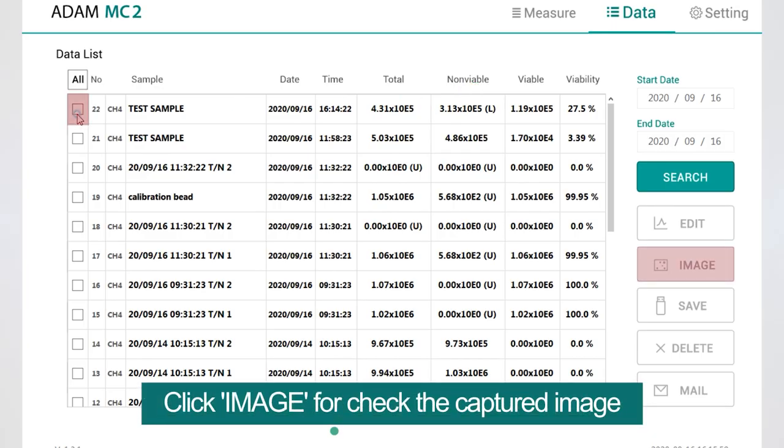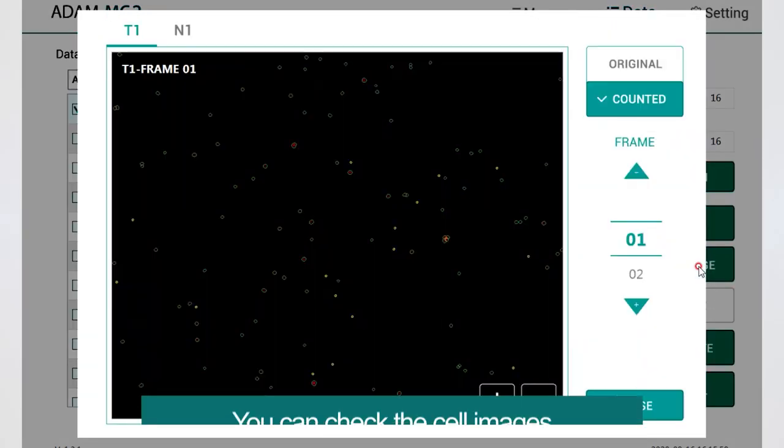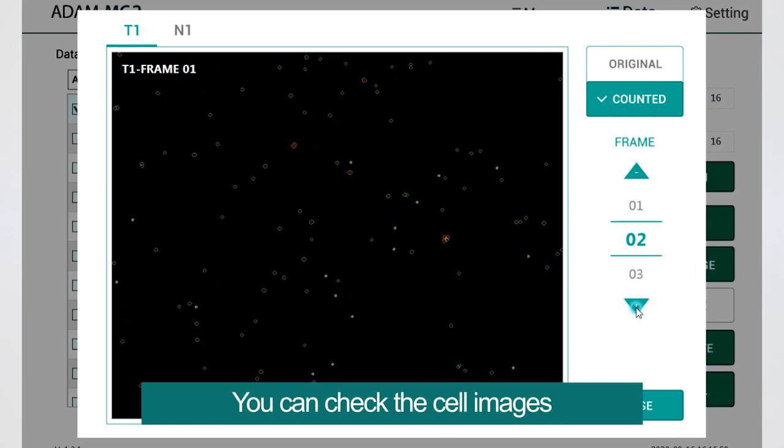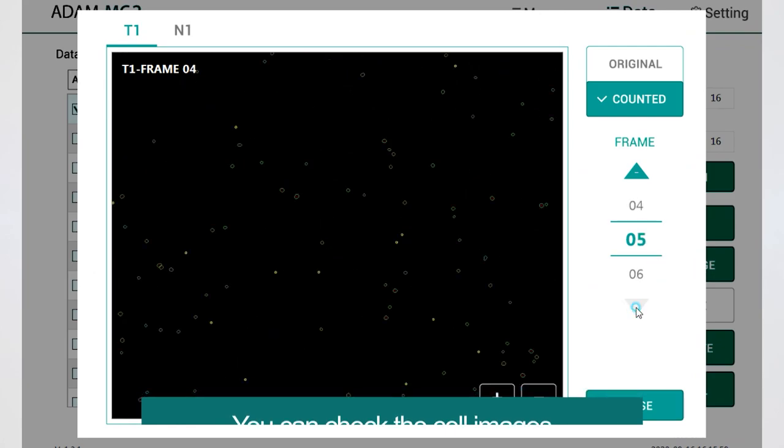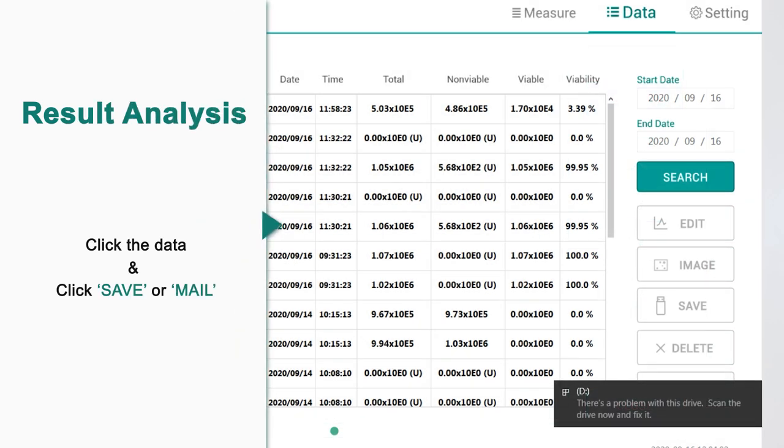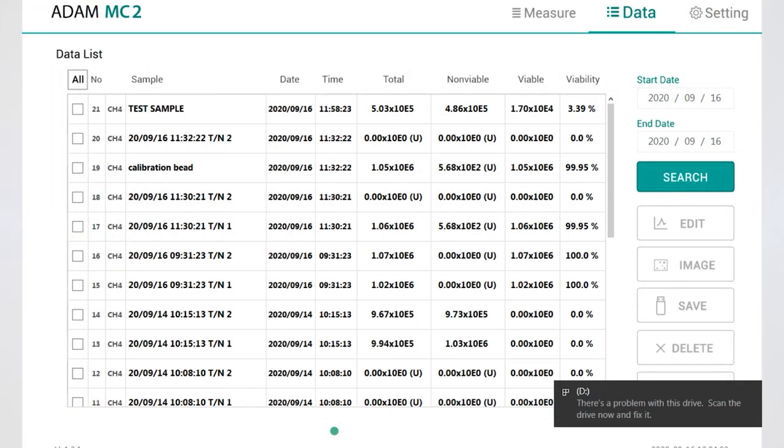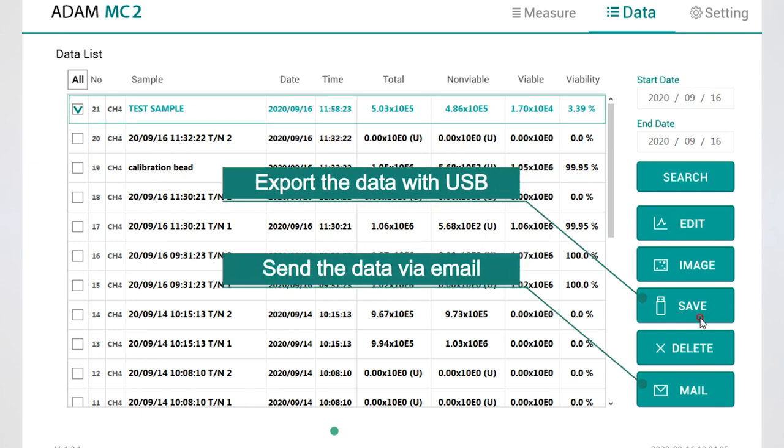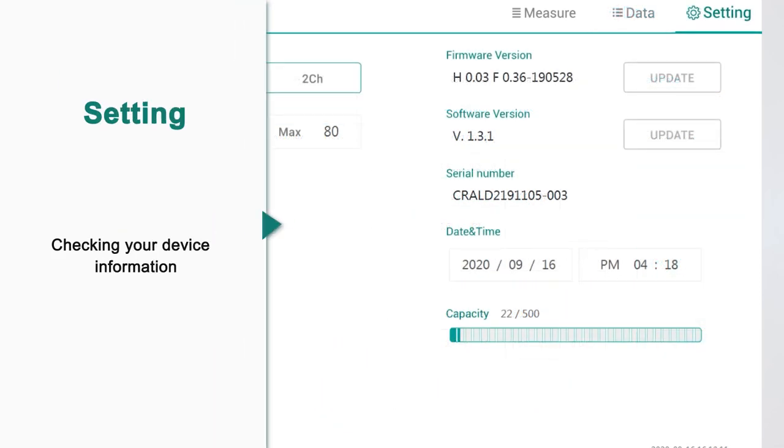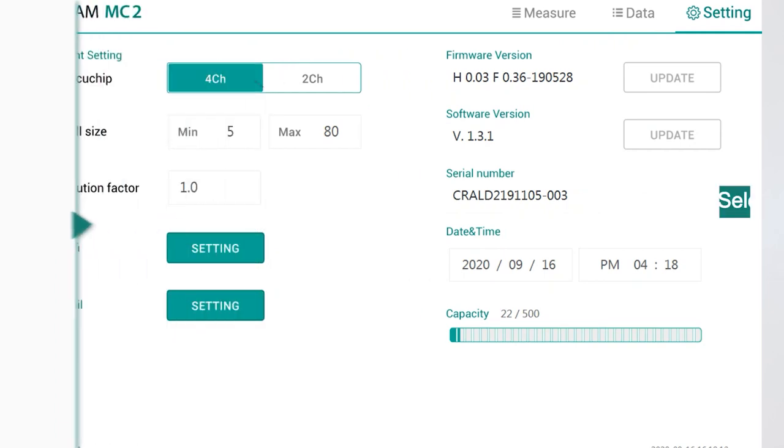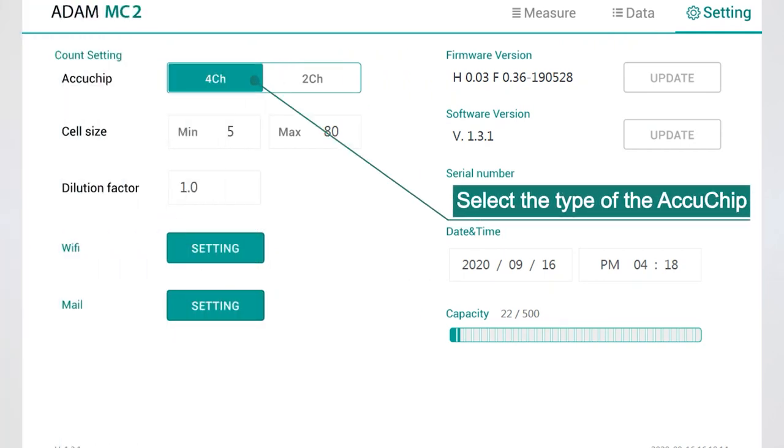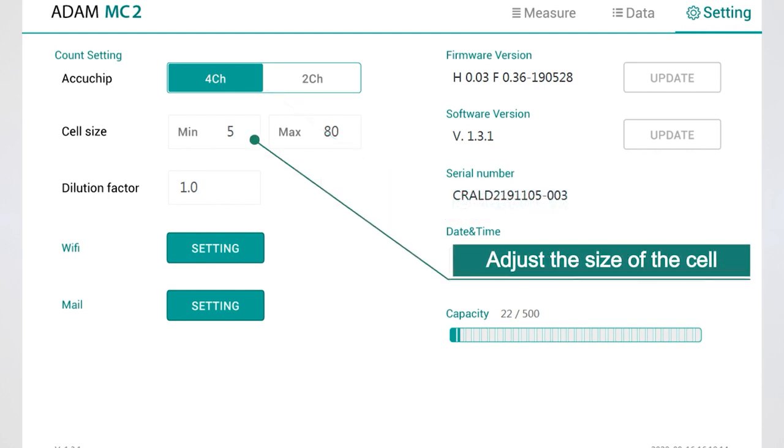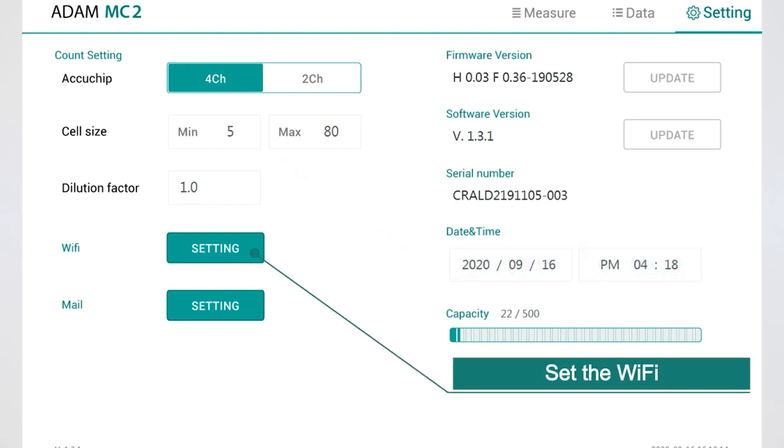You can select the type of the AccuChip, adjust the size of the cell, set the Wi-Fi, and check the device information.